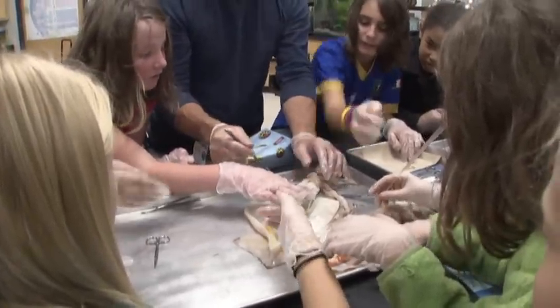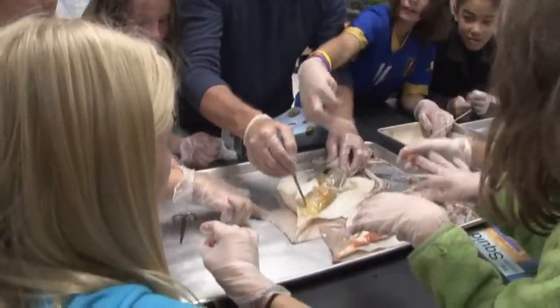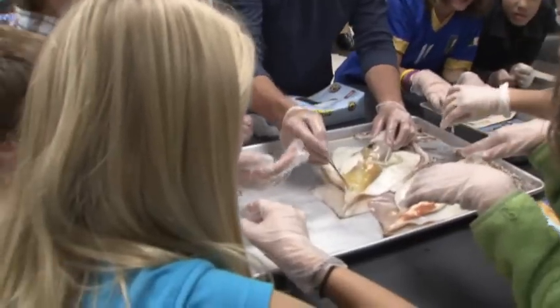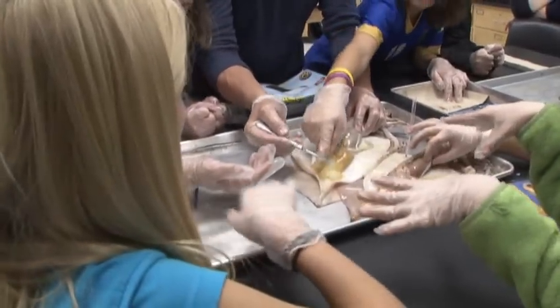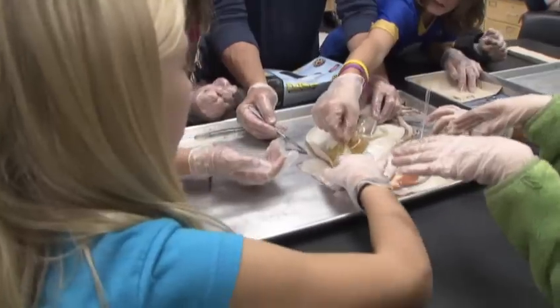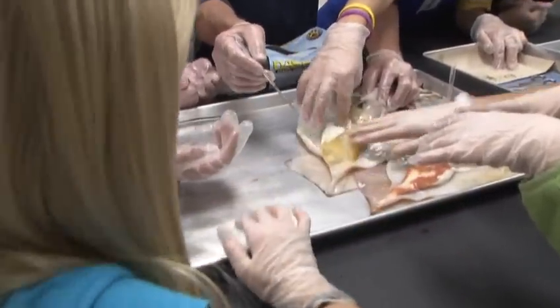They watched the video of it. Should we cut open the egg sac? Yes, we'll do that. Well, the eggs, it's actually already cut open, but see right here, look. This is all egg. You can probably eat this too. I'll bet you there's many cultures that eat eggs. You know, you don't waste anything. Looks like applesauce. Yeah.